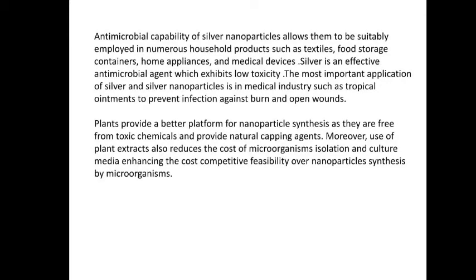Plants provide a better platform for nanoparticle synthesis as they are free from toxic chemicals and provide natural capping agents. Moreover, use of plant extract also reduces the cost of microorganism isolation and culture media, enhancing the cost competitive feasibility over nanoparticle synthesis by microorganisms.